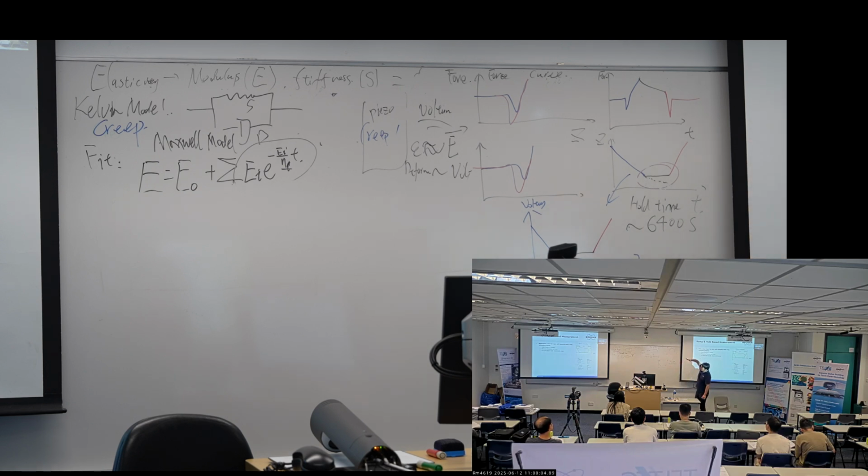But really, I reach this height, I hold the voltage. But the piezo itself, it has a creep. It will continue moving down, and its real movement is something like this. So this kind of phenomena is not what people want. They want the height to be controlled as I designed. I don't want the piezo to be creeping.